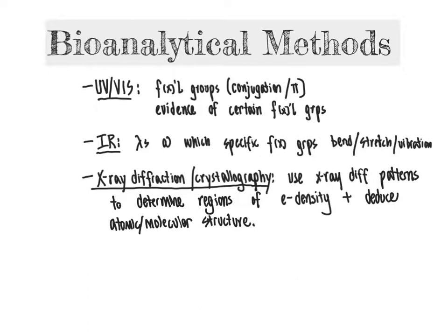But as with most powerful techniques, there are some limitations and caveats. The biggest limitation that comes into play frequently for X-ray crystallography is that it requires that you be working with a compound that you are able to generate crystals of. And so it is not applicable for liquids, for example, because liquids are not crystals. It is applicable for proteins and nucleic acids if you can crystallize them. Some proteins are readily crystallized, others not at all. And so that has to be kept in mind as a limitation of this particular method.